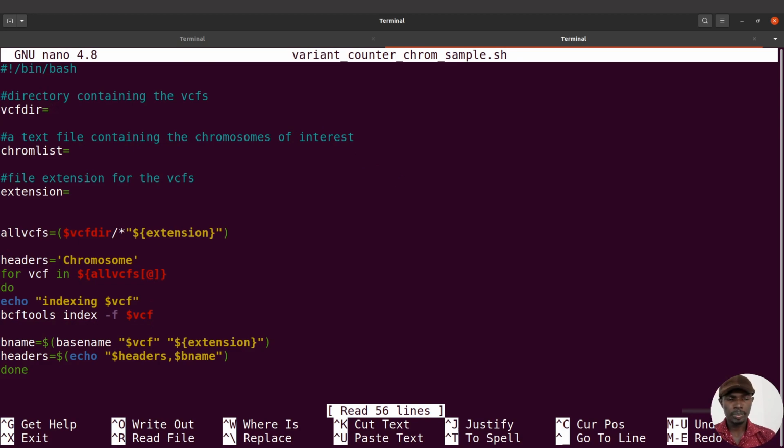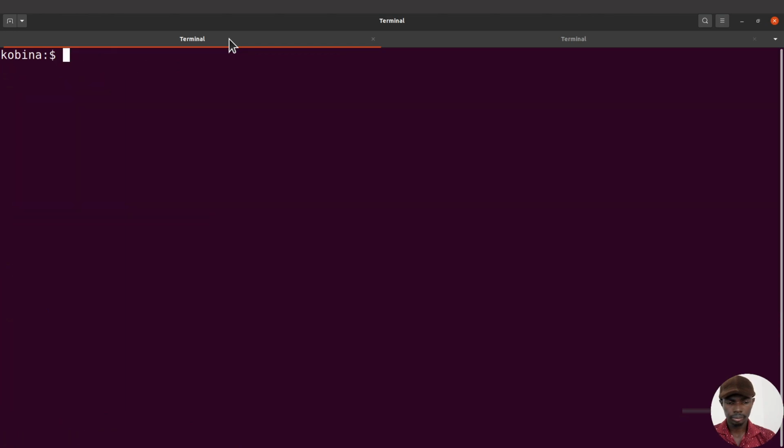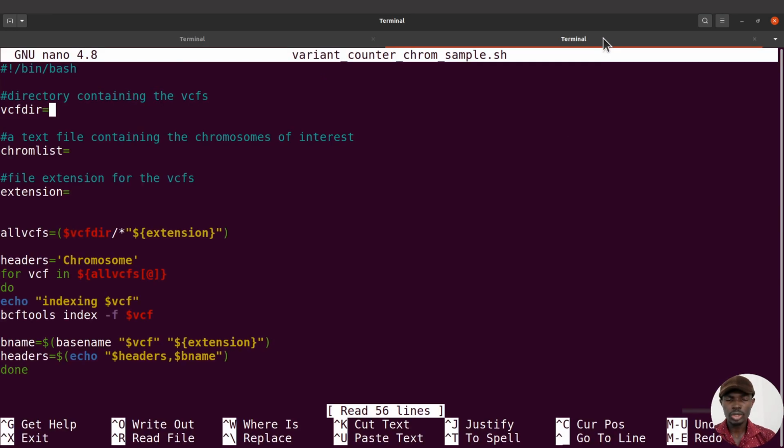So first of all, we need to supply that script with the directory of the VCFs. You can see that the VCFs are here. Let's clear the screen. Let's do an ls into VCFs. You see them here. Let's do an ls. So there's the VCFs directory. That's it. So I need to supply it here. I'll bring my double quotes and I'll say VCFs like this.